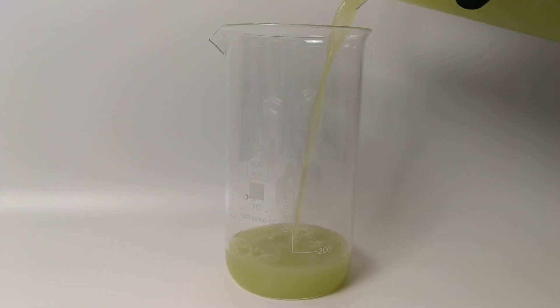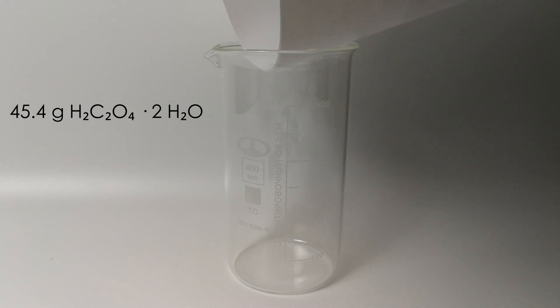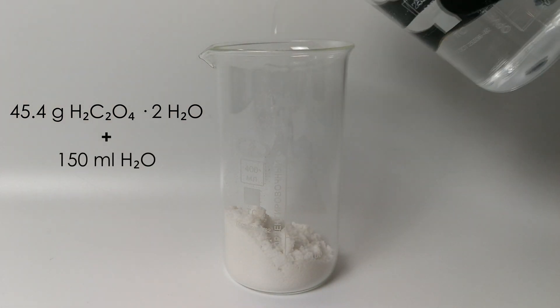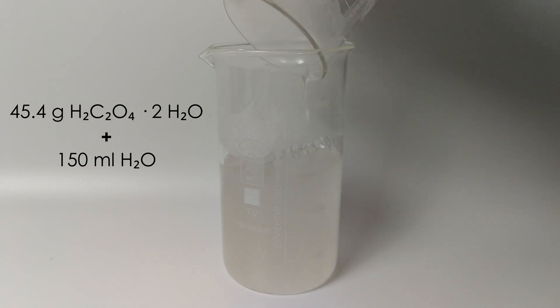The second beaker turned out to be too small, so I washed the first one and transferred the solution back into it. Next, we add 45.4 grams of oxalic acid dihydrate to a separate beaker and dissolve it in 150 milliliters of hot water.